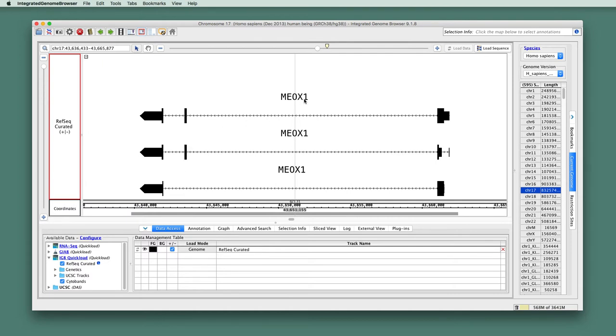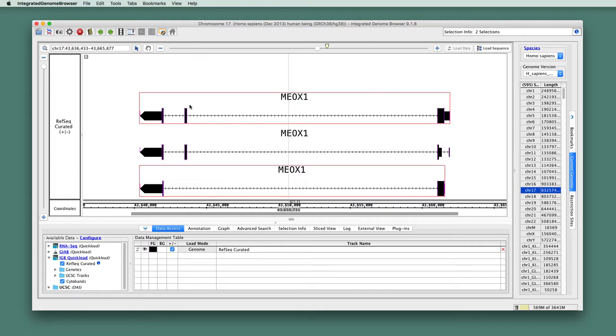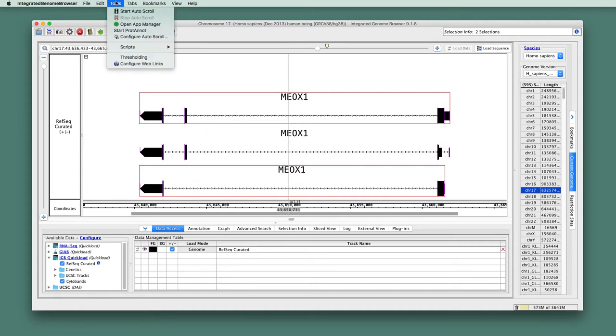So to use ProtoNote, what you do is you select gene models that have protein translations associated with them, and that's what these tall boxes represent. These are the translated parts of the gene models. So we select those, and then we go to the Tools menu, and we choose Start ProtoNote.